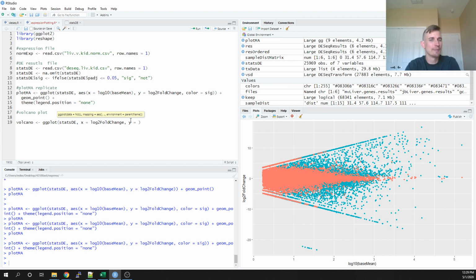But not only that, it's the adjusted p-value. It's a log transformed p-value. Our p-value ranges between 0 and 1. Looking at that directly isn't very hard, but we can turn those into integers. Instead of these fraction values of 0.00 something, I can do a log transformation, specifically a negative log 10 transformation. That will turn these values into values greater than 1, so they'll be turned into integers.